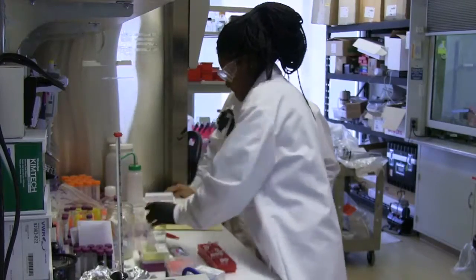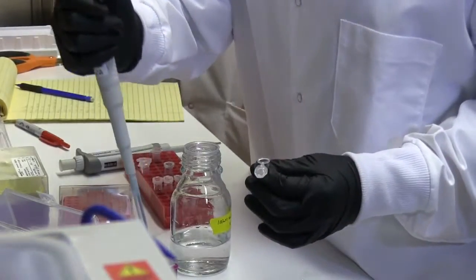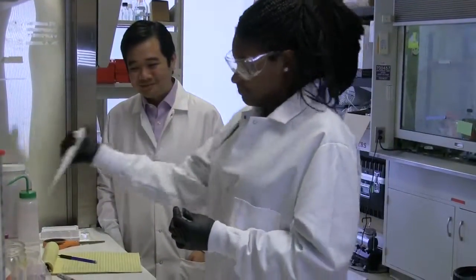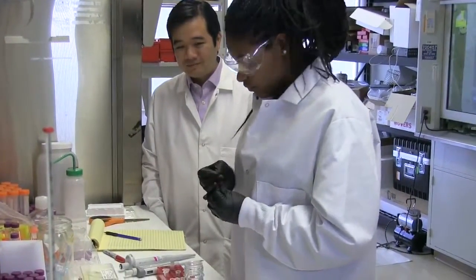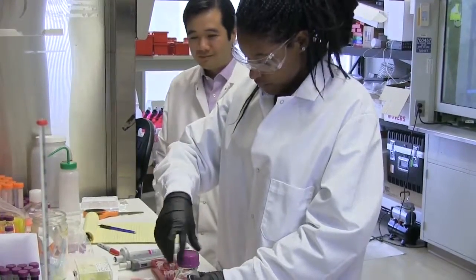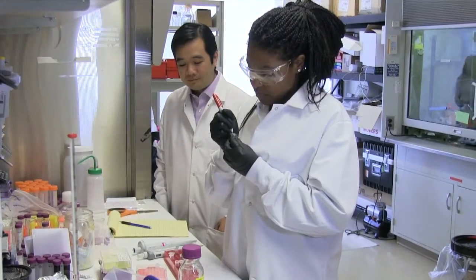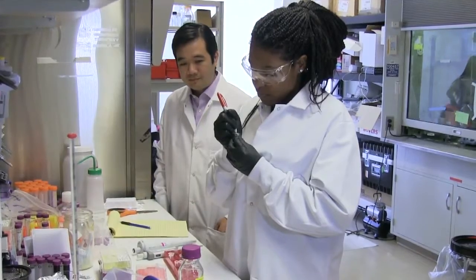In my lab back at Howard, I work to synthesize silver phosphate nanoparticles and encapsulate them in polymers. So I actually have experience working with nanoparticle synthesis. Right now I'm working on the synthesis of the sensors, and we're going to test its response to hydrogen peroxide. So we're going to measure the fluorescence intensity, if the peak either increases or decreases once we introduce hydrogen peroxide to the sensor. And then later on down the line, we're going to actually start working with cells and see how the sensors work inside the cells with hydrogen peroxide.